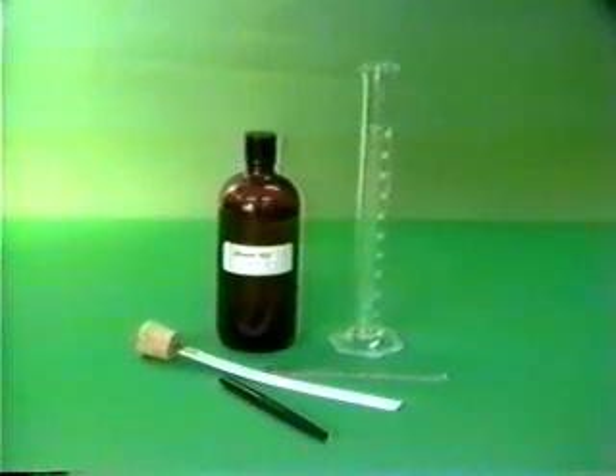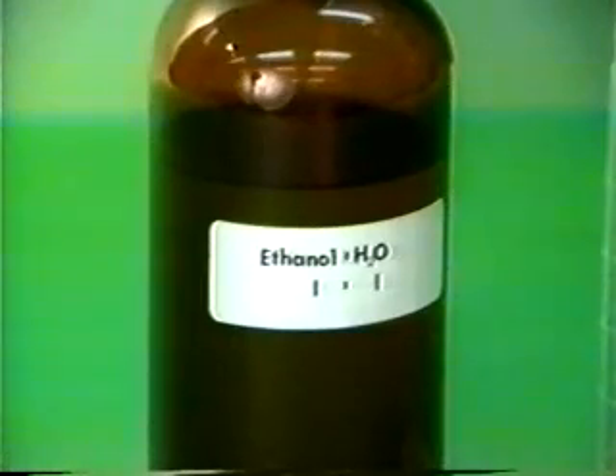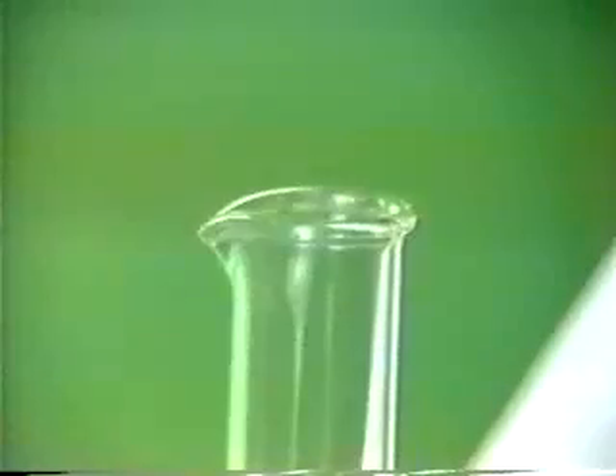In this paper chromatography experiment, the solvent ethanol and water, one-to-one by volume, is poured into a graduated cylinder.